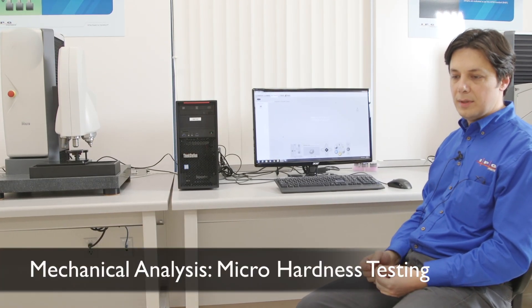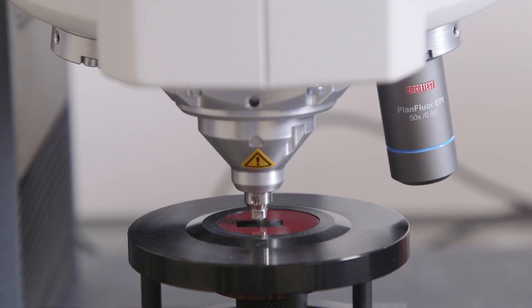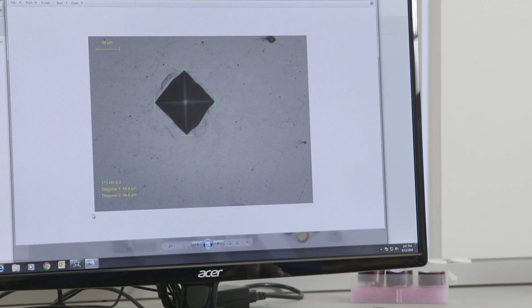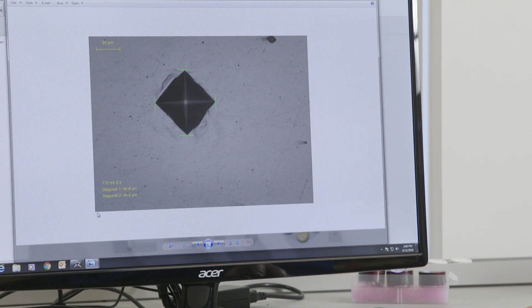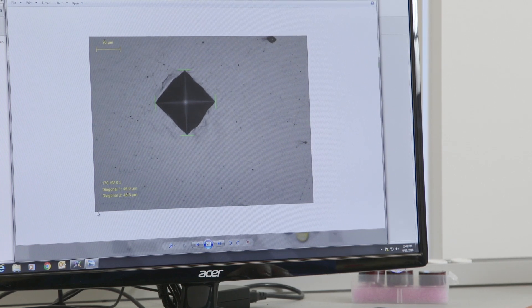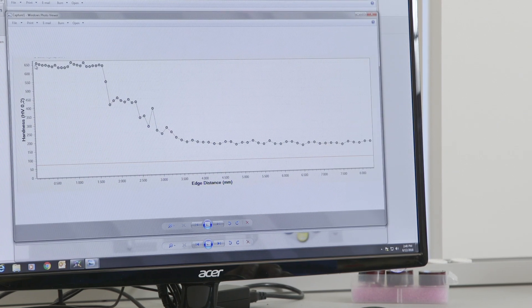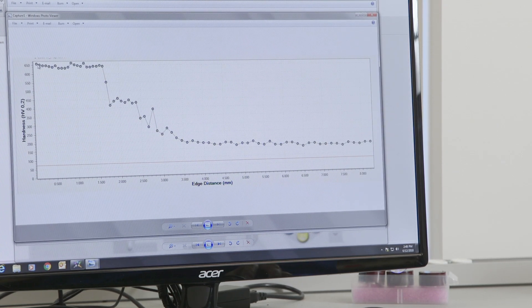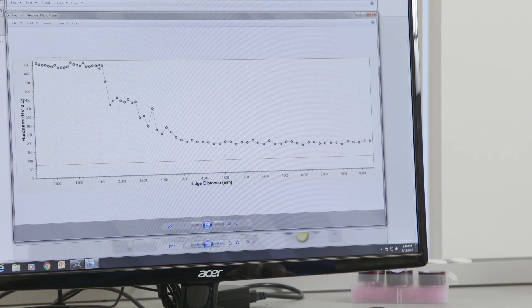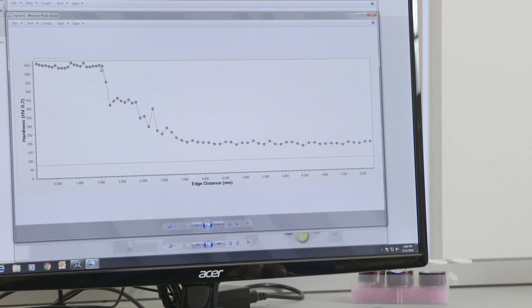In micro hardness testing, we use a low level of force to create very small micro-level indentations. This is a Vickers micro hardness test performed on the weld zone of a process sample, and the size of the indentation is measured optically by the system. We can produce typical graphs like this — many micro hardness measurements along a line crossing the weld zone, heat affected zone, and base metal.